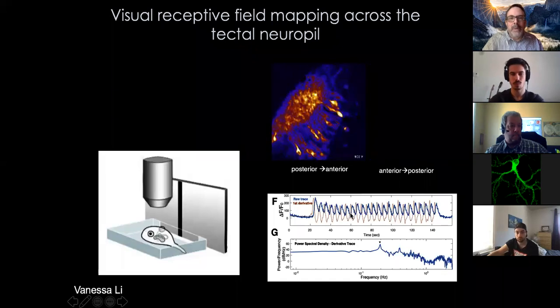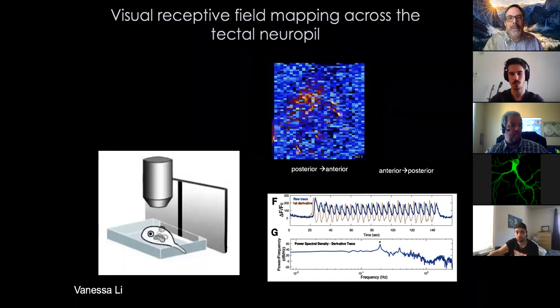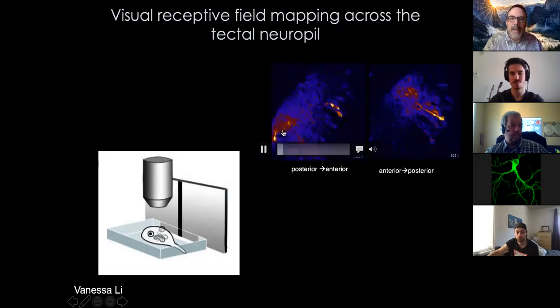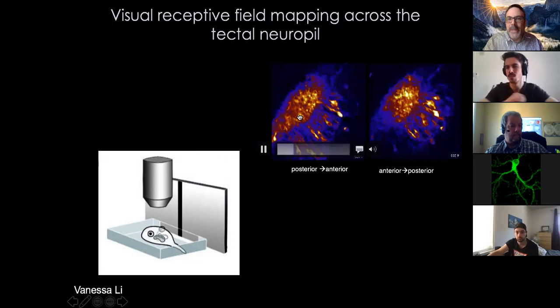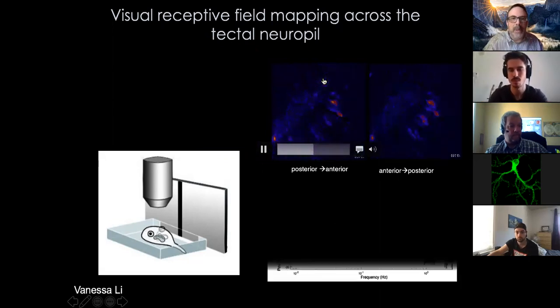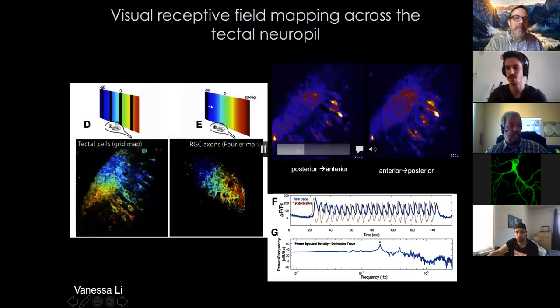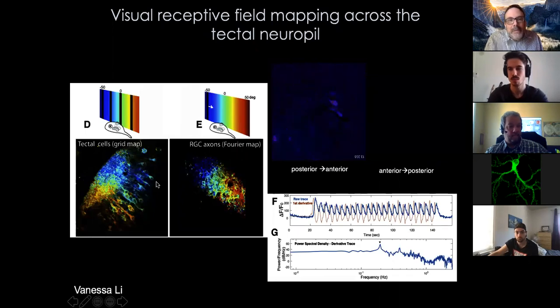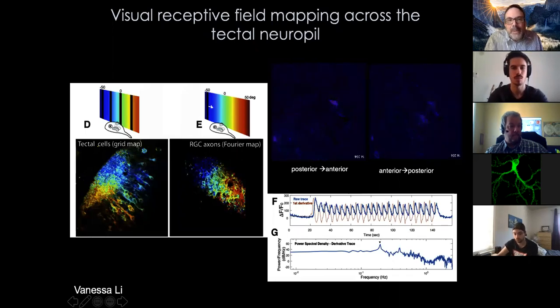So as the bar sweeps across the field, there are going to be early elements that have an early phase, and then later phase corresponds to things that are at the other end of the sweeping bar. And we can generate maps like this. These are topographic maps at the subcellular level of the visual system in the optic tectum. So this is a map for the postsynaptic cells. This is a map for the presynaptic inputs using these approaches.